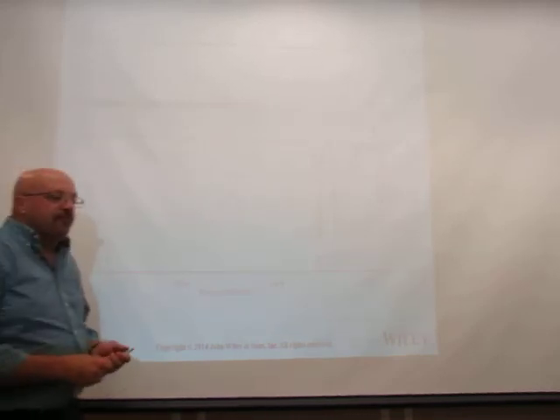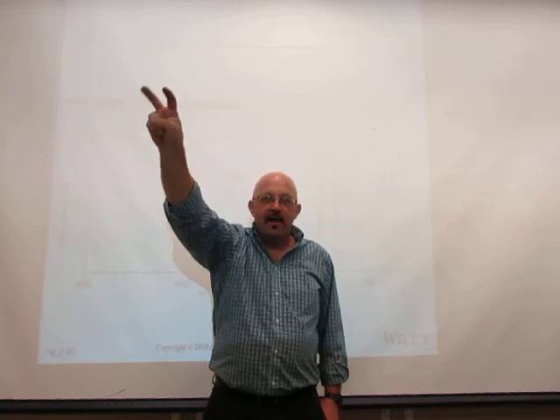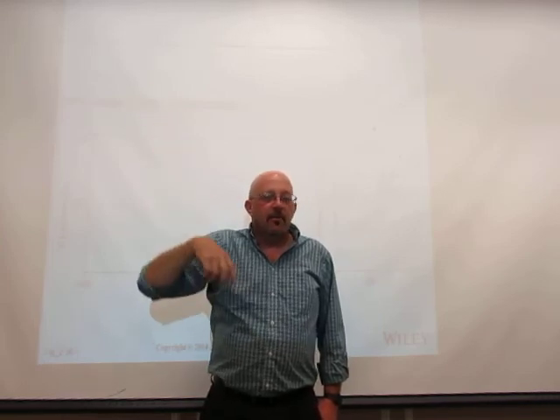They're called Nitro Fangs because the two peaks are normally about the same size. So you've got those two peaks hanging down that are about the same size. They look like a pair of fangs, like a snake's fangs or something. So we call them Nitro Fangs. They're always about the same size, maybe just a little bit of difference.